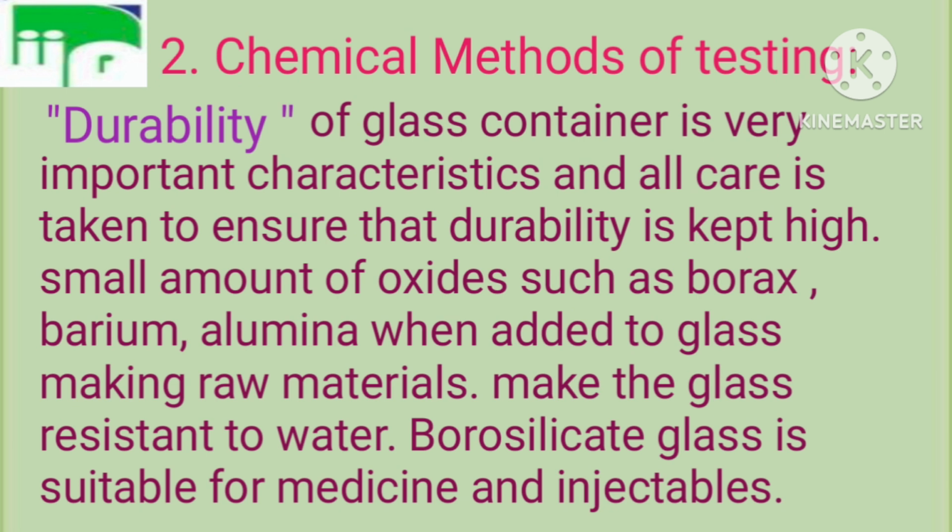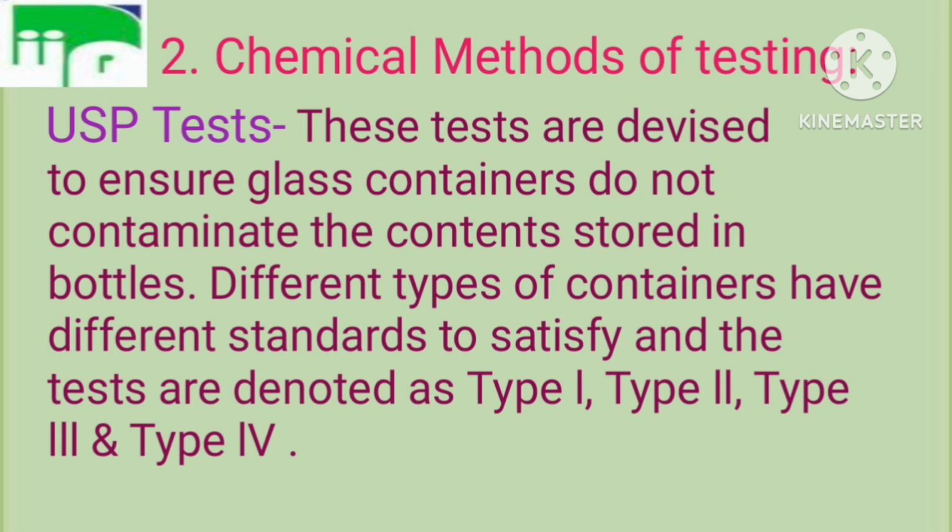Durability of glass container is a very important characteristic and all care is taken to ensure that durability is kept high. Small amounts of oxides such as borax, barium, alumina when added to glass making raw materials make the glass resistant to water. Borosilicate glass is suitable for medicines and injectables.